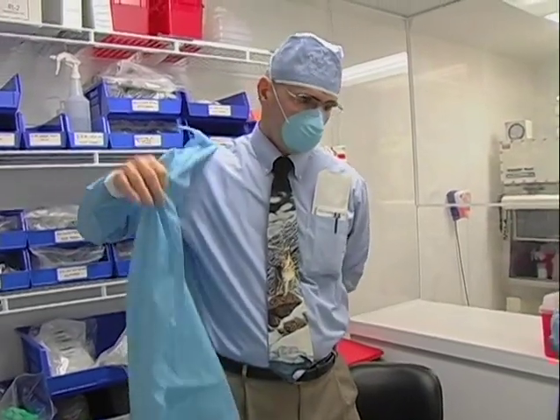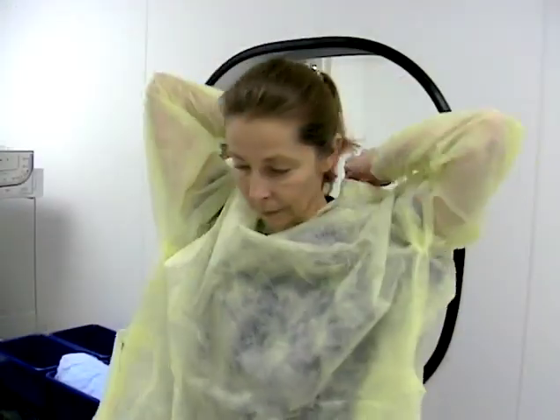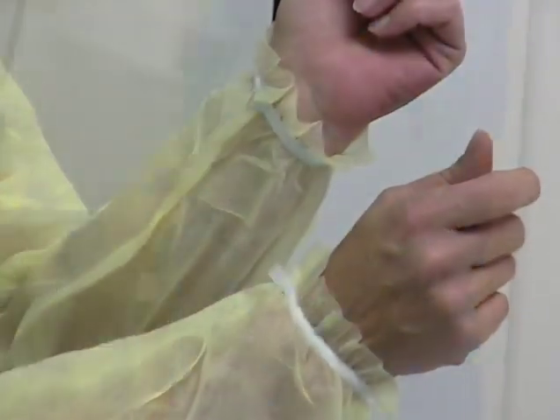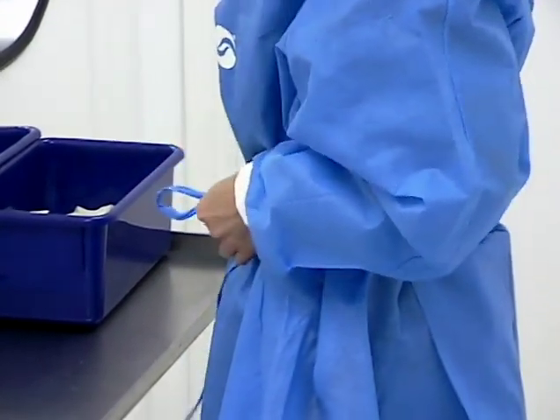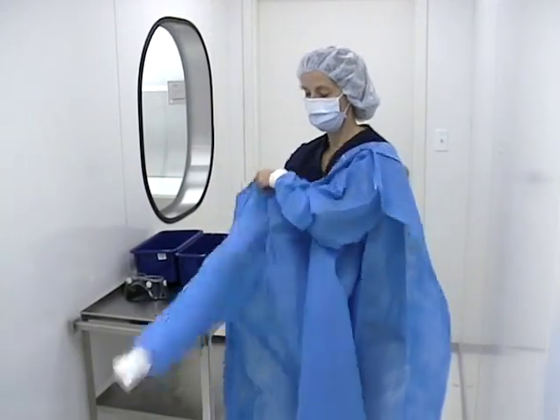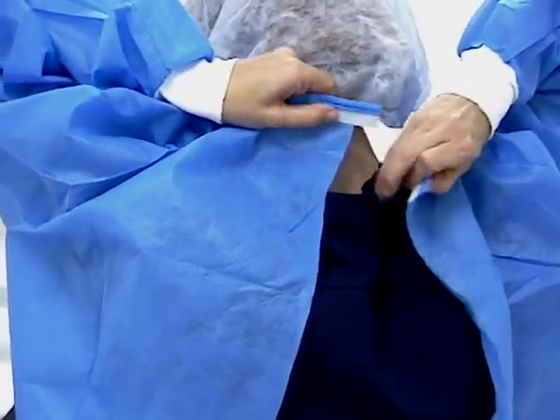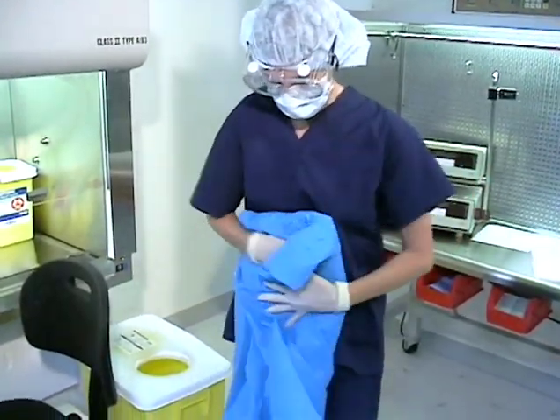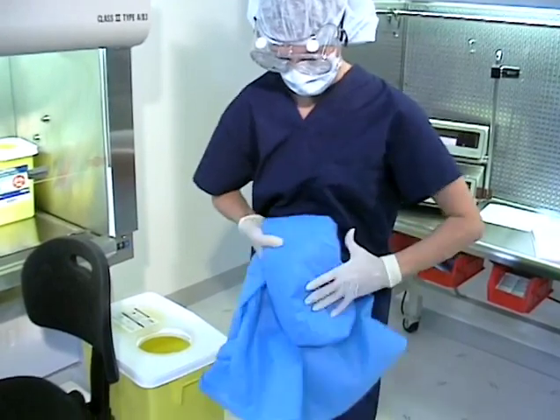The gown or lab coat is used to minimize the shedding of both viable microorganisms and non-viable particles from the operator's clothing. When compounding hazardous substances, the gown used should also protect the operator and should be resistant to penetration by the products manipulated. It should provide elastic cuffs to limit exposure of the operator's arms and closure at the back of the gown. Disposable gowns are preferable. If non-disposable gowns are used, they must be handled carefully and laundered as contaminated materials.